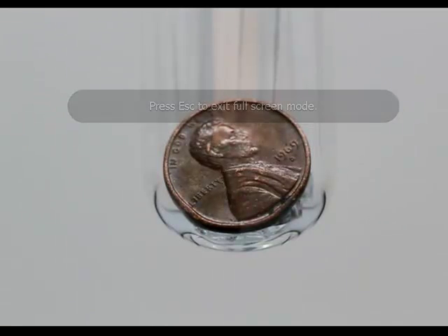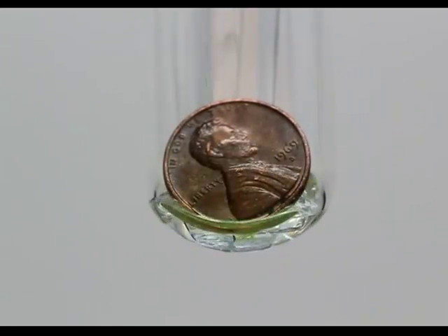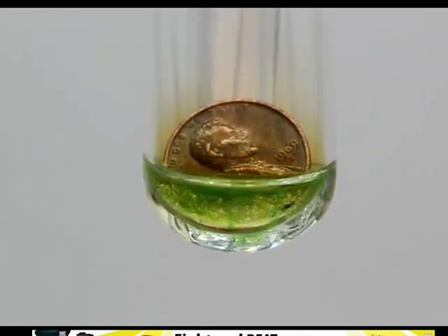This here is a 1969 copper penny, and concentrated nitric acid is being added to the penny.